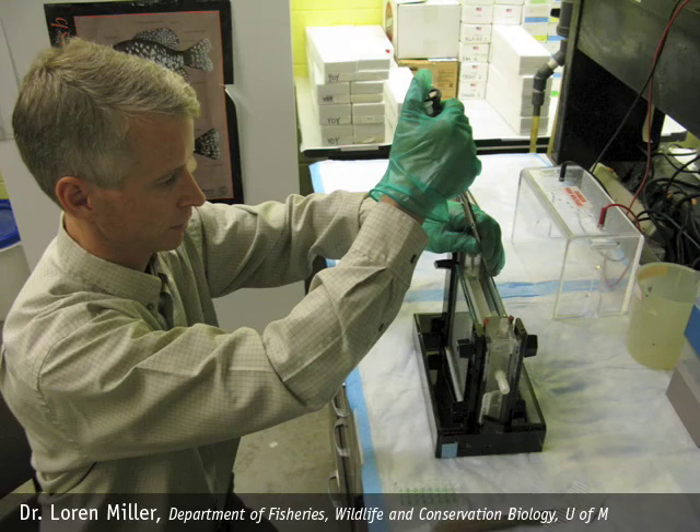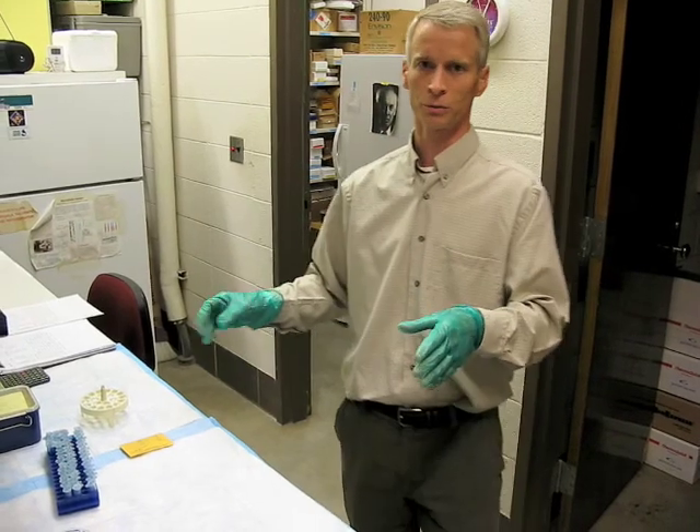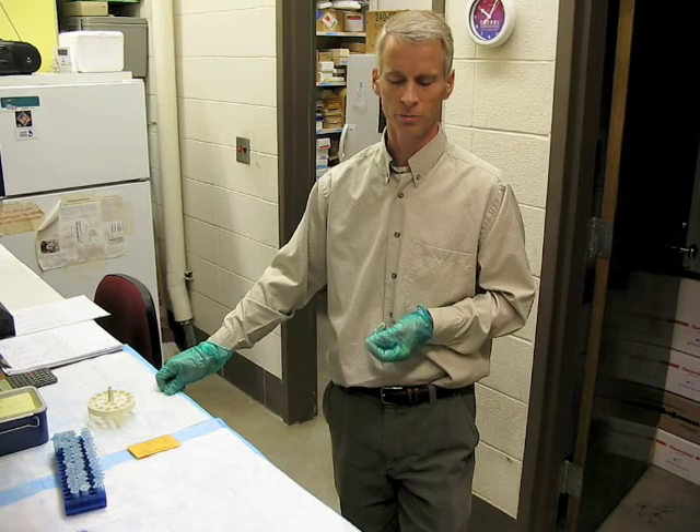Hi, I'm Loren Miller. I'm a research associate in the Department of Fisheries, Wildlife and Conservation Biology at the University of Minnesota. What I'm going to do is take you through what I would do with a sample that I bring into my lab to convert it from a fish in the field into some genetic data that I can then use to study aspects of fish populations.